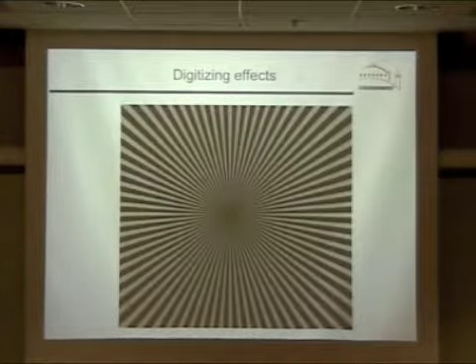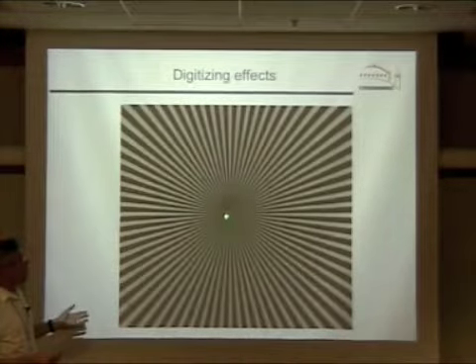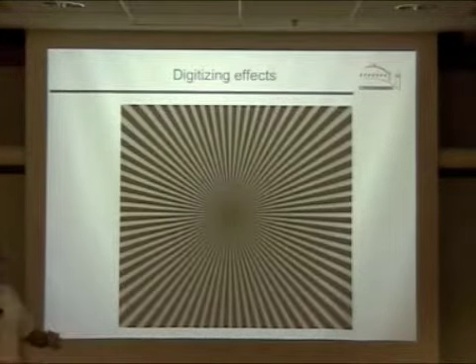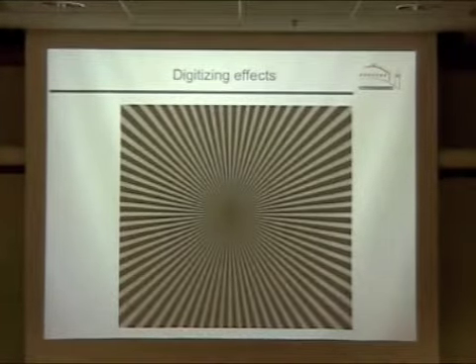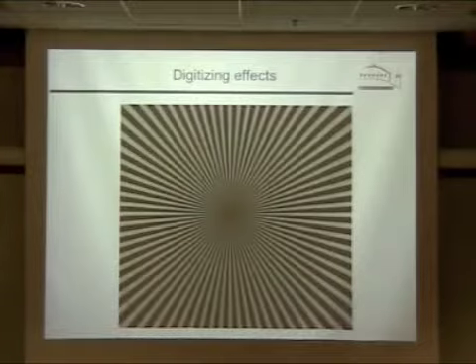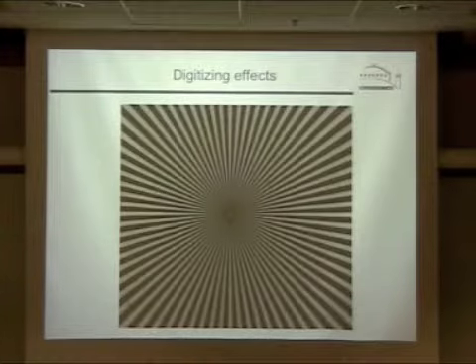The point was, first off, that the contrast of this image of a perfect test pattern isn't very good in the high resolution range. That's an effect of the modulation transfer function of the digitizing system and possibly the projector here. That's the sort of thing we face anytime we record an image and then try to digitize it.